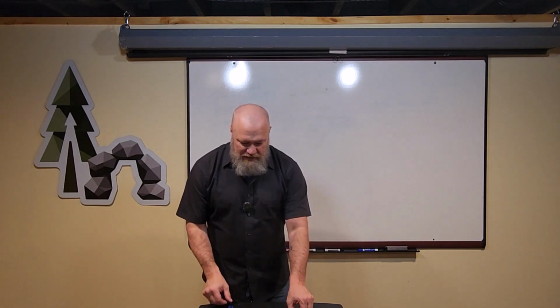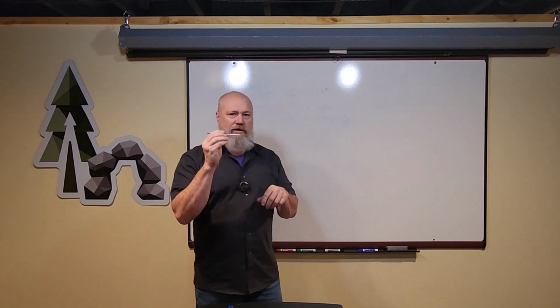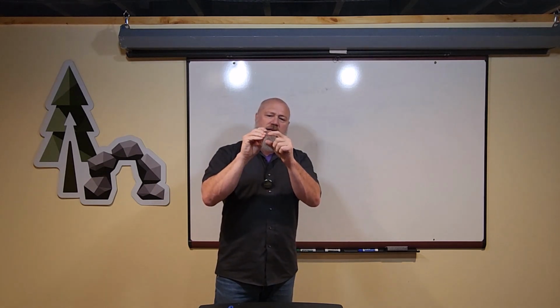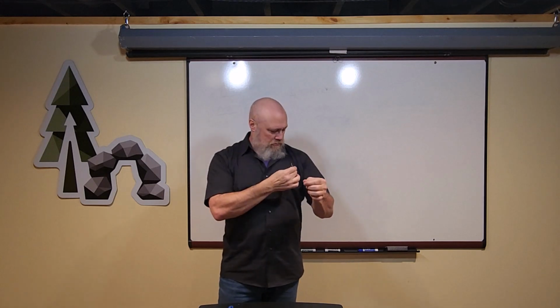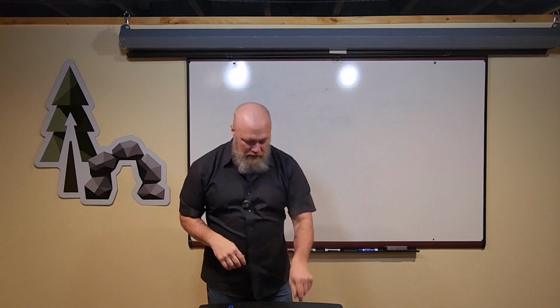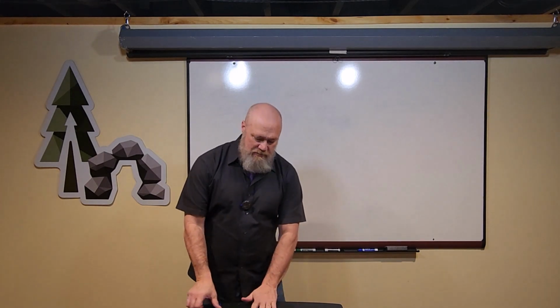Next, you're going to need a good set of forceps. I don't even hand out the regular forceps anymore. These are basically tweezers, but they've got a little tiny notch here and a hook here that bites together. That's called a rat tooth forcep. So they can grab onto slippery structures and give you a good purchase. And you're going to be using these a lot, especially when you do any sort of sharp dissection.